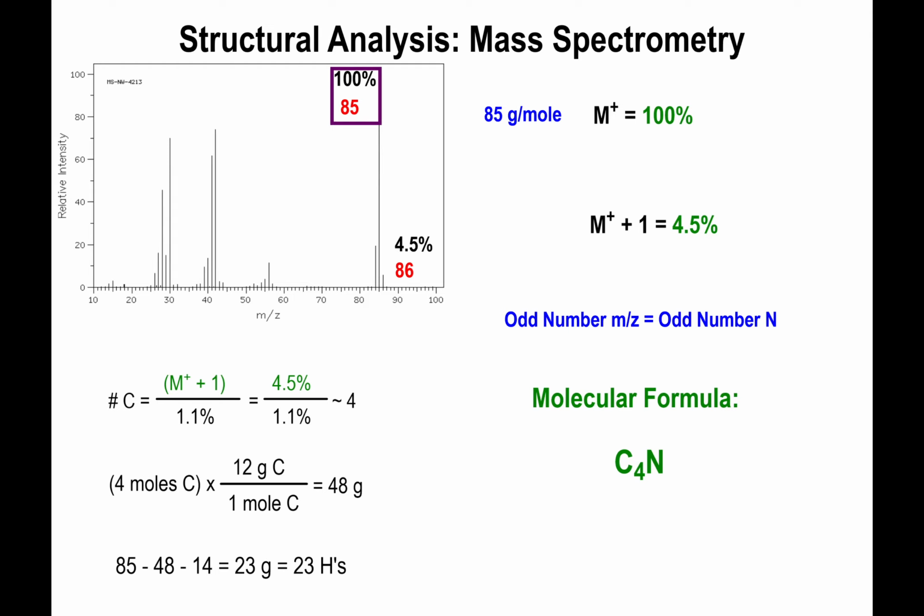So then the only other choice, in the absence of an M plus 2 peak, is for you to have oxygen. We cannot do more nitrogens because we go past the allocated mass. So we're going to introduce oxygen, because this is the only other element that, even if you don't have an M plus 2 peak, you can add to the formula to adjust for the mass.